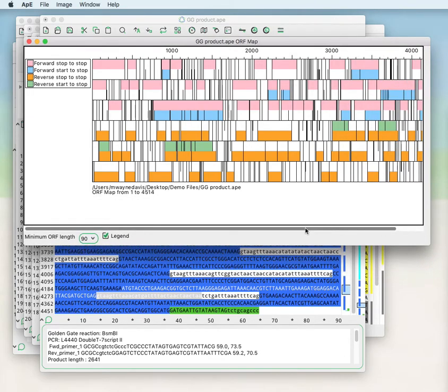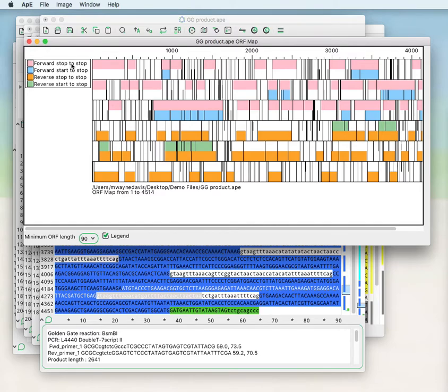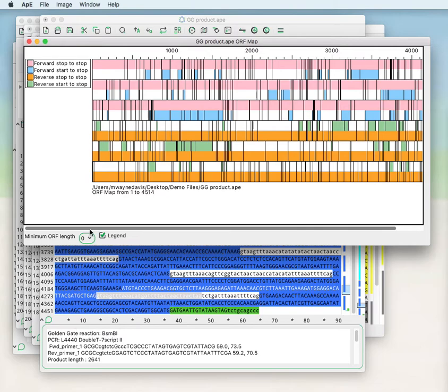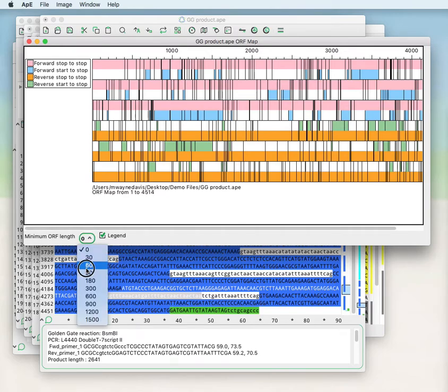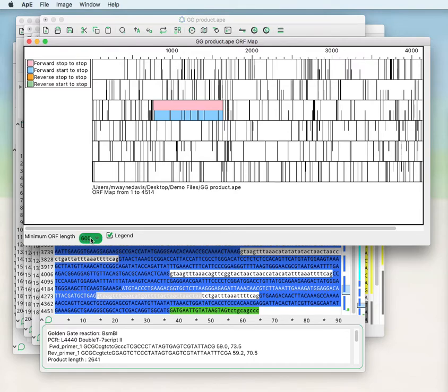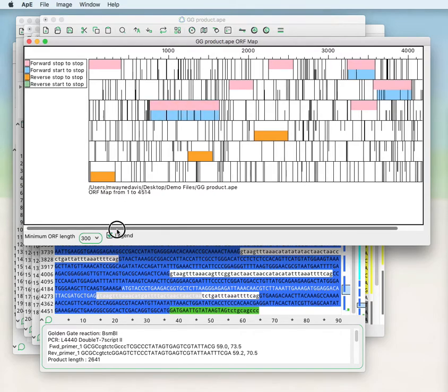It's scrollable and you can see that there are six different horizontal rectangles. Three of them are pink and blue, representing the forward three reading frames. Three of them are orange and green, representing the three reverse frames of the sequence. You can set the minimum open reading frame length here. As you increase the minimum open reading frame length, you see that fewer and fewer regions are highlighted in pink, blue, orange, or green.